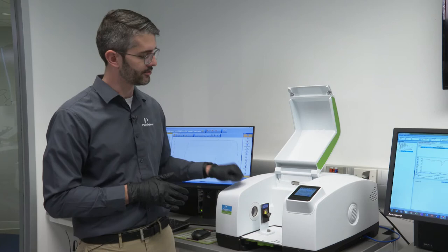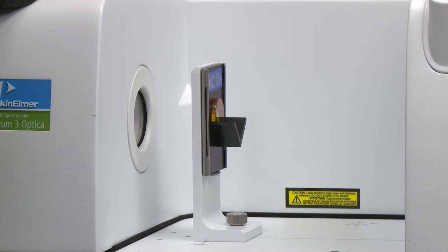So with the Spectrum 3 Optica, the light comes from the interferometer to a mirror up front and is diverted towards the sample surface here in the sample compartment of the instrument.